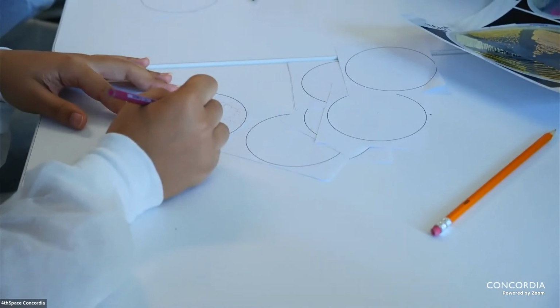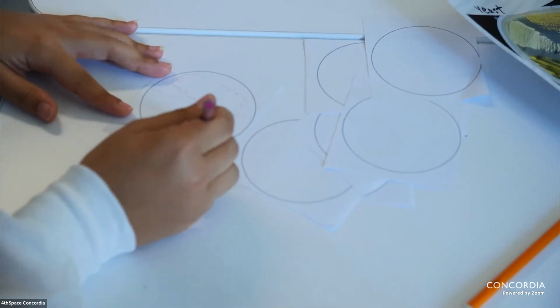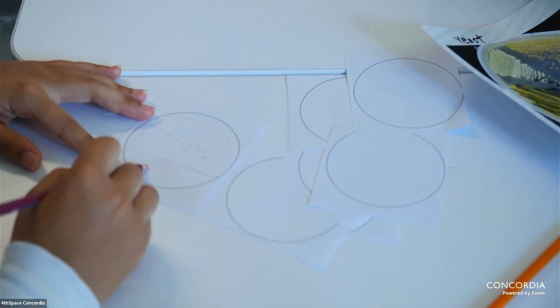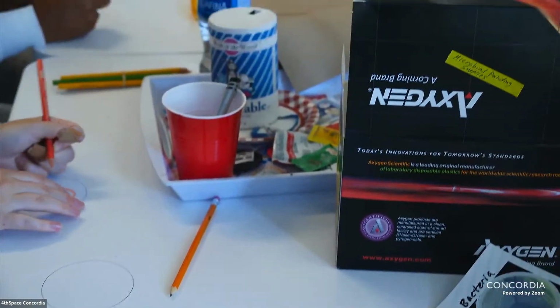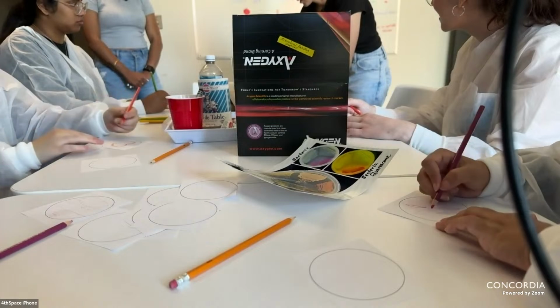We did this activity last year with the CGEP students, and here are some examples of the plates that they made. We will take photos of the plates and send them to you in your email.